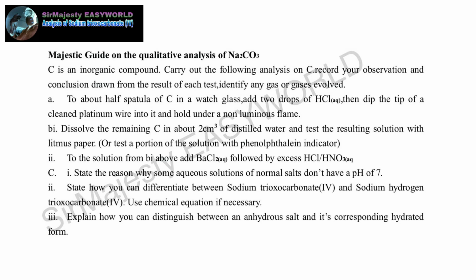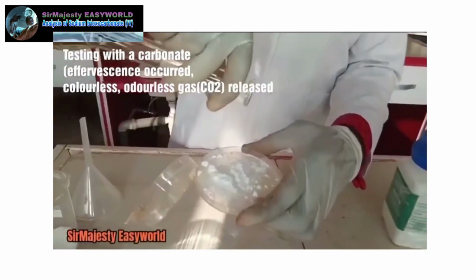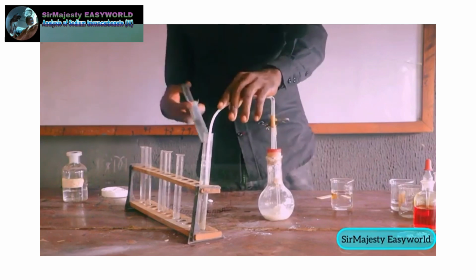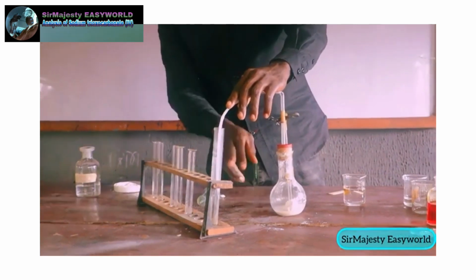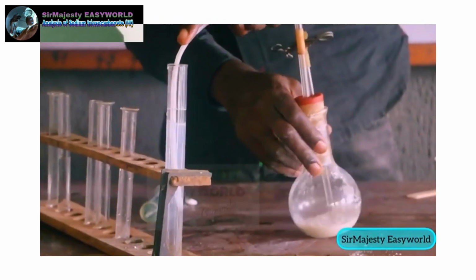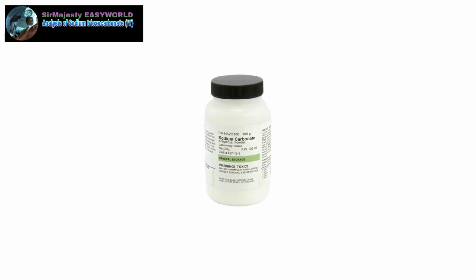So now the next thing is that you might also be required to test for trioxocarbonate 4 ion, that's CO3, either by adding an acid directly. Addition of an acid to any salt that contains trioxocarbonate 4 ion will lead to effervescence, leading to the evolution of colorless, odorless gas which turns lime water milky, and your inference will tell us that the gas is CO2 from CO3 2-, or the use of barium chloride followed by excess HCl or equally HNO3.